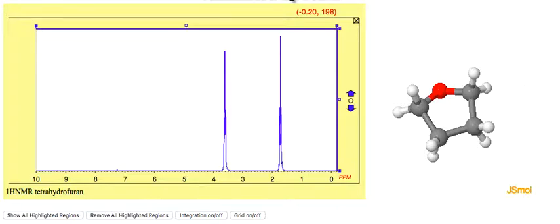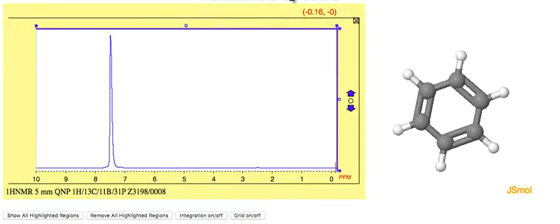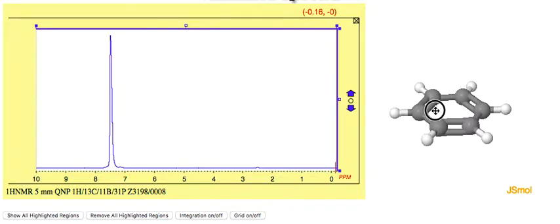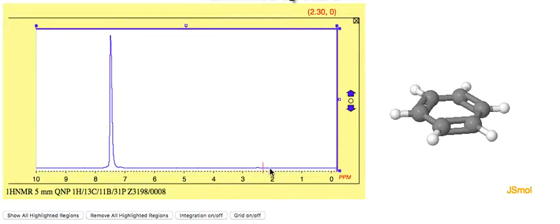Now, I've got one more here to show you, which is benzene. And we've got an interesting feature here. So first of all, 6 of them are equivalent. And very much like with the ethene, the doubly bonded one, that peak has been pulled way, way, way on down here to 7.5. So it's unsplit.